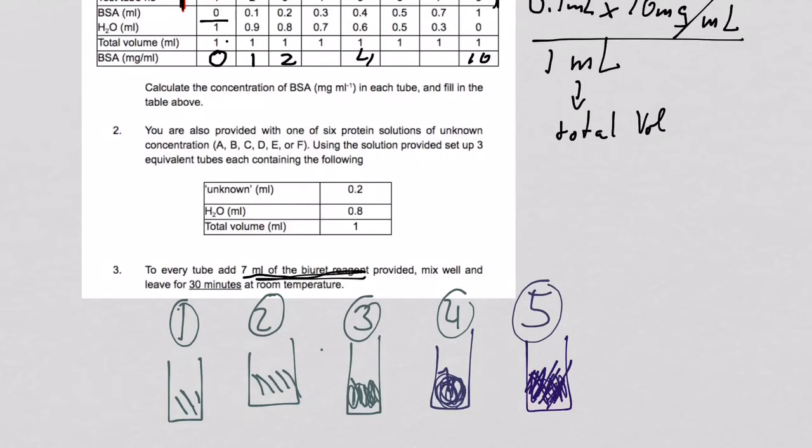You get it? Yeah? If this is not the case, if you've got light blue, dark blue, light blue again, then there is something wrong. But you can very easily spot that. It should get more and more blue, purple, dark, the more you go up. Yeah?